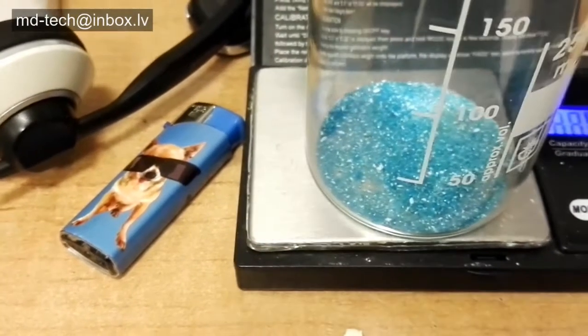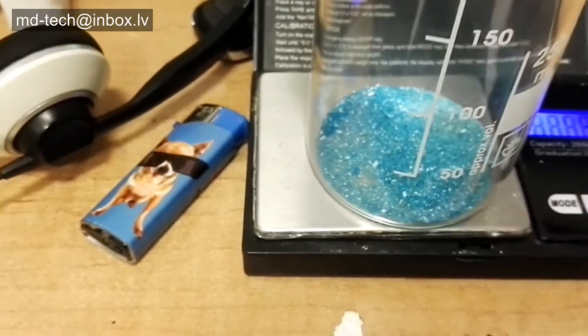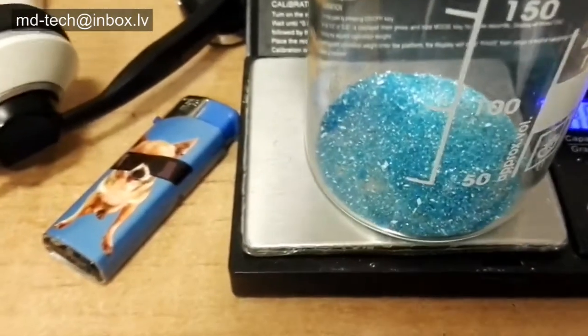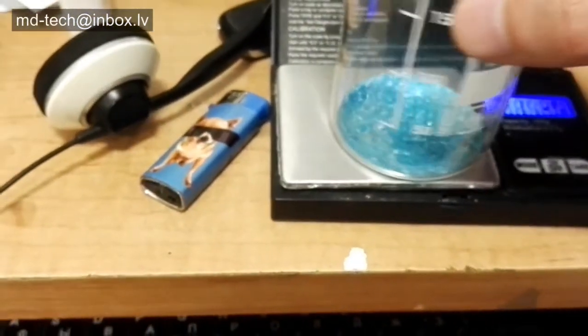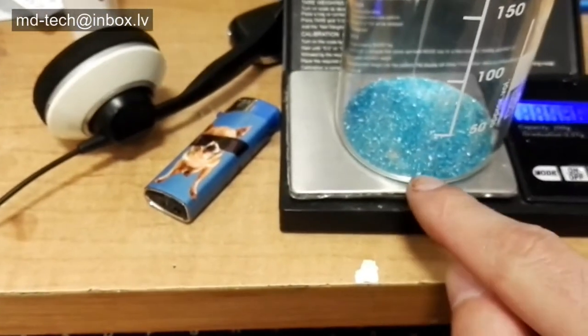Today I show how to make copper nanoparticles, about 100 nanometers. First you need to dissolve copper sulfate in water. I use 2 grams of copper sulfate in 4 milliliters of water.